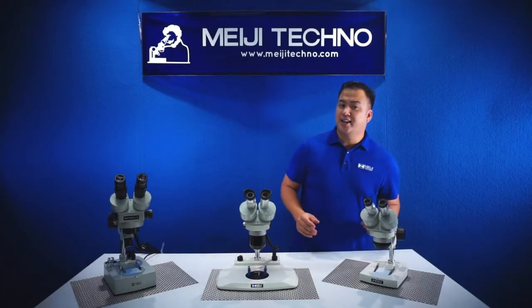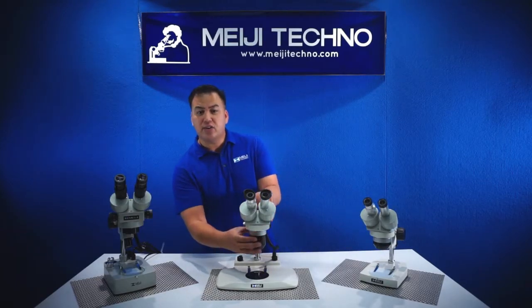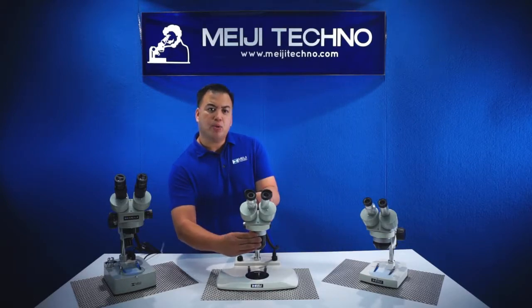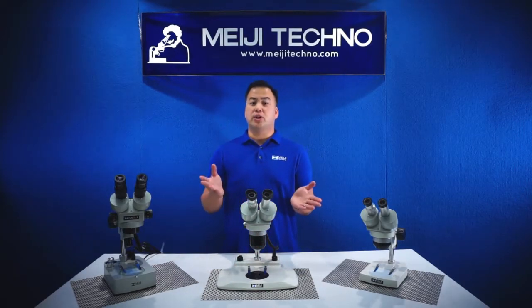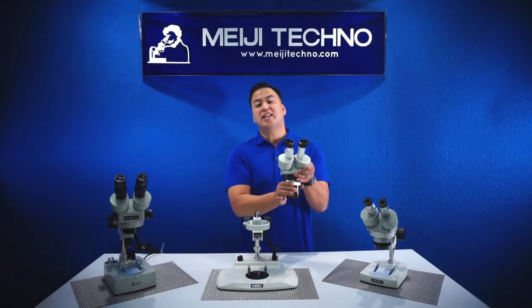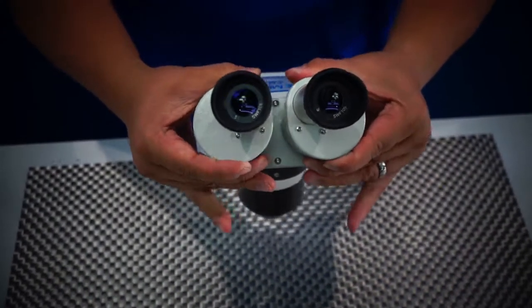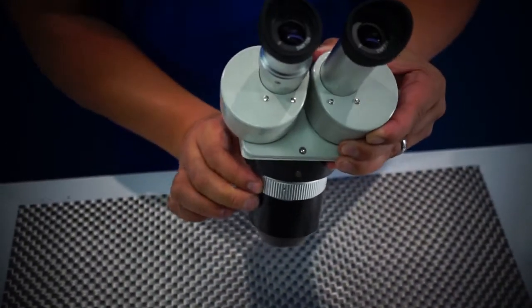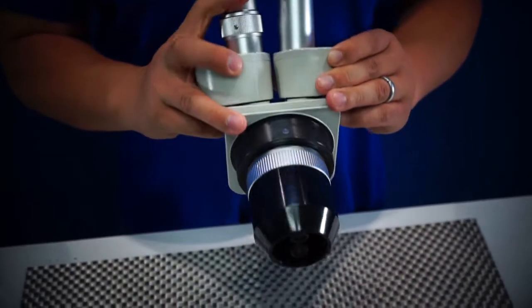Our second line is our EMT series, which has a turret body meaning it can give the user two different magnifications per body. As you can see here, I'm rotating the body and it's switching from one to the next. The EMT series is currently available in two different models. The EMT1 has a magnification of 1x and 2x, giving users 10x and 20x magnification with a 10x eyepiece, while the EMT2 gives the user magnification options of 1x and 3x, giving them 10x and 30x with a 10x eyepiece.